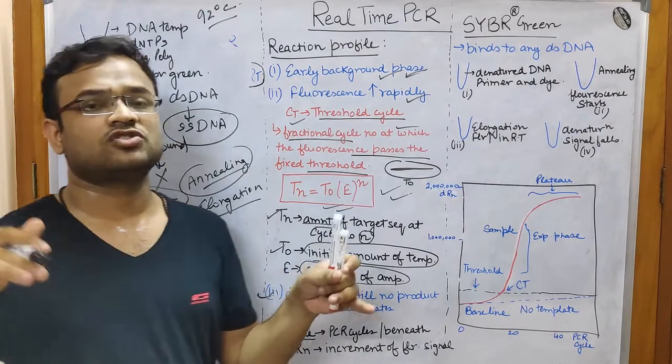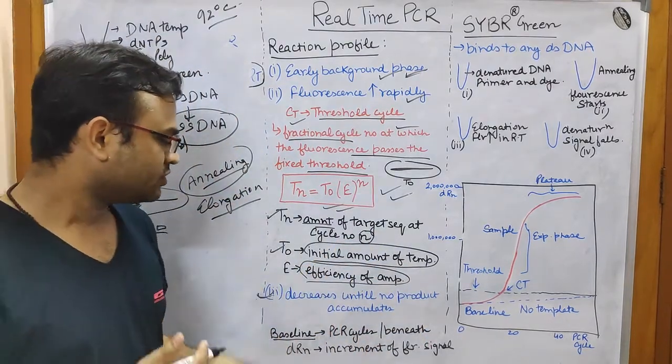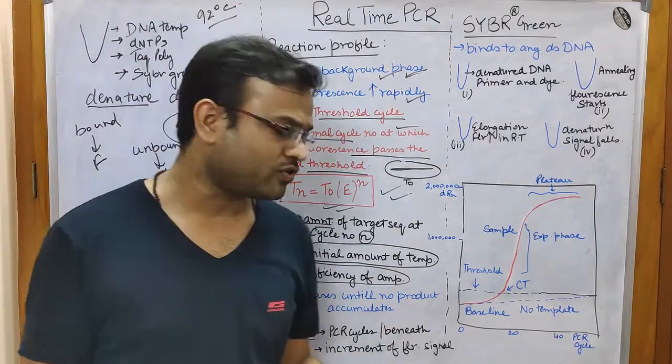After the product stops accumulating, what will happen? The fluorescence will of course decrease. So this was the reaction profile.